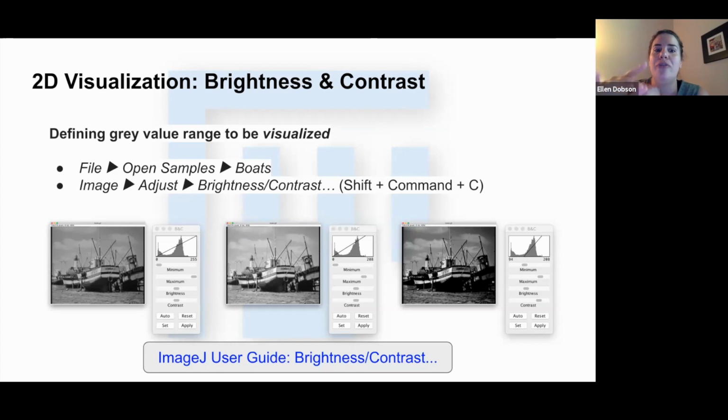You could type in and look for brightness and contrast tool, and then it'll tell you what every single button and function does on that window. But I think that sounds correct. But you wouldn't necessarily need to do that unless you're worried about, for publications or something, that you need to save the image in a certain range. But yeah.